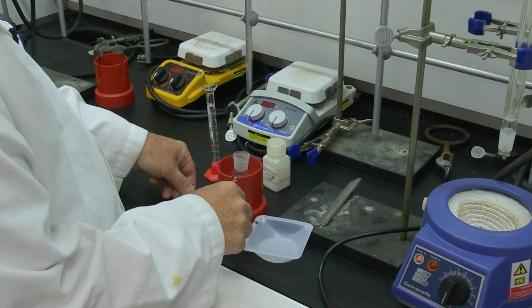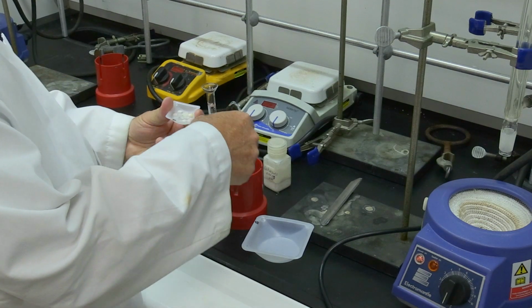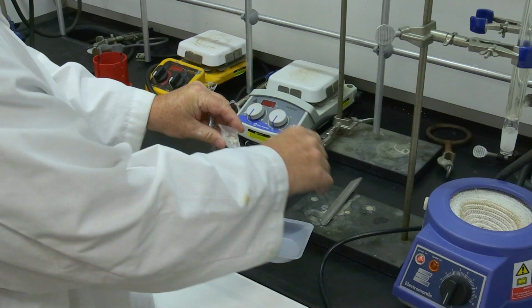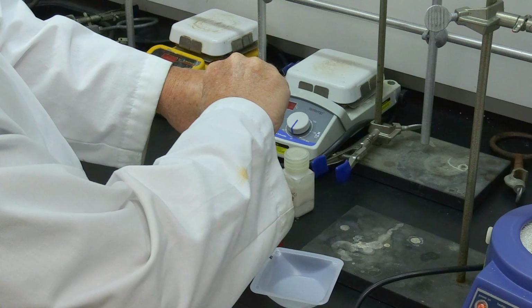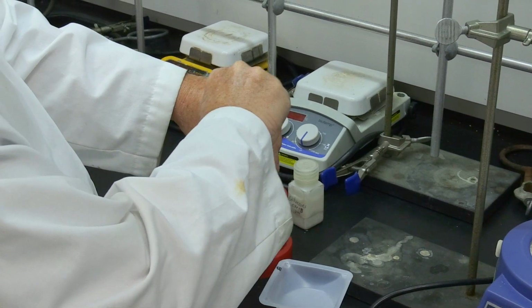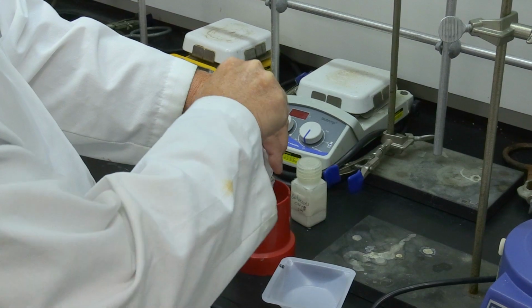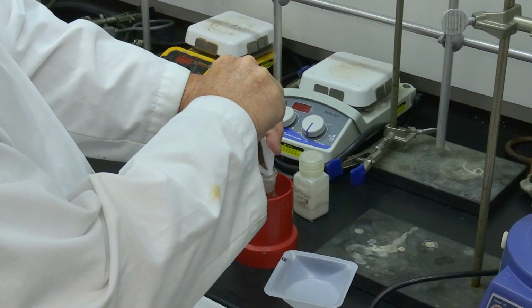And we'll also add the sodium hydroxide, again, which picks up moisture, so we have to kind of force it in a little bit. That's pretty good.